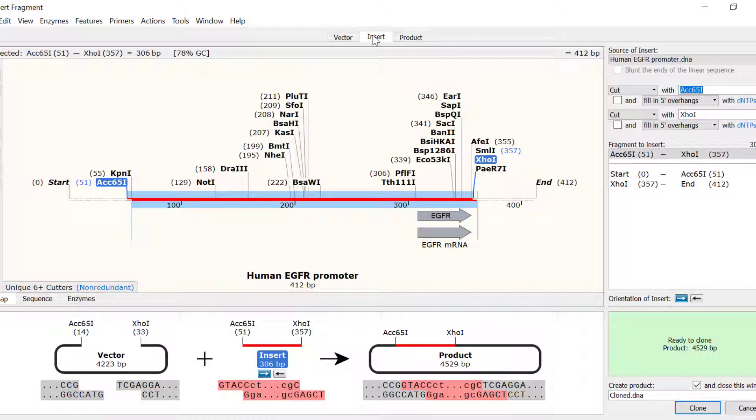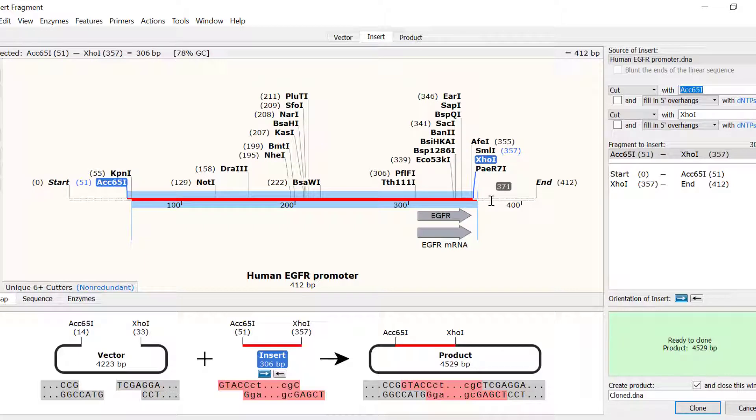For the insert, the parts that are coloured white indicate the region that will not be included in the cloning.